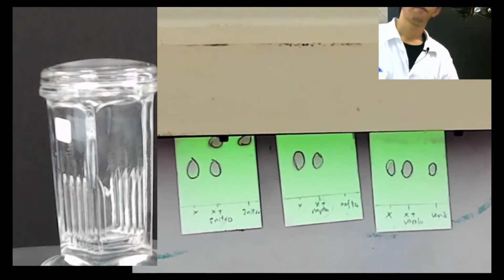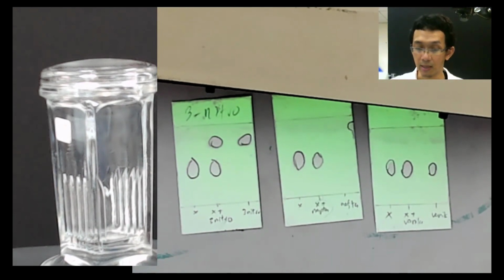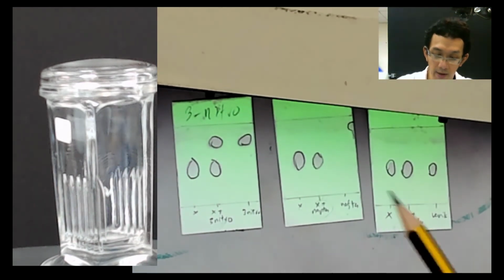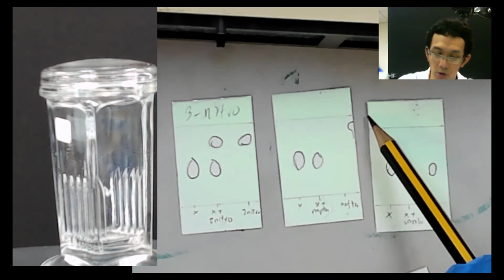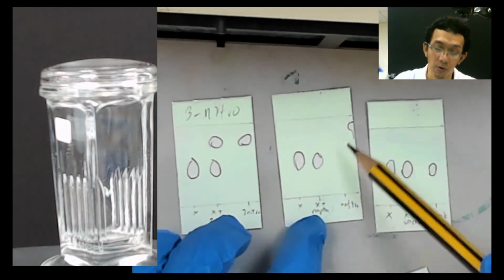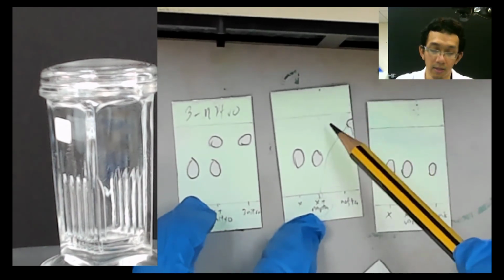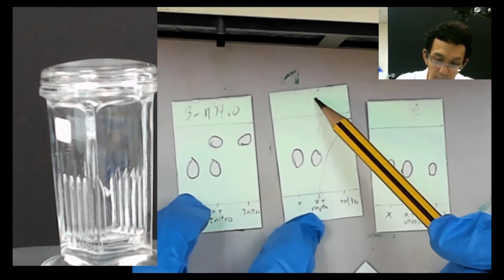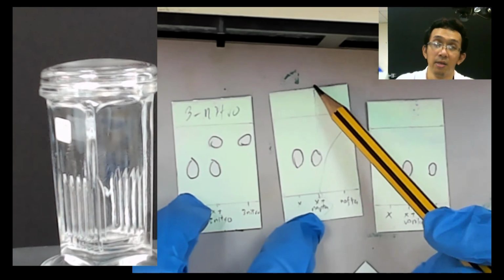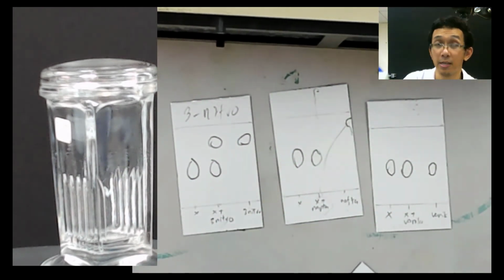The TLC is very, what we call, very sensitive. So even though you put very small or big, it doesn't really matter. The reason for this is maybe naphthalene bleeding to the side. It goes to the side and so on. Because remember, when things happen, you don't know. Maybe the naphthalene goes here, it goes somewhere here like that, or goes far from here. Maybe it goes up until you don't see it. So that's why the choice of the solvent as a mobile phase can make a difference.